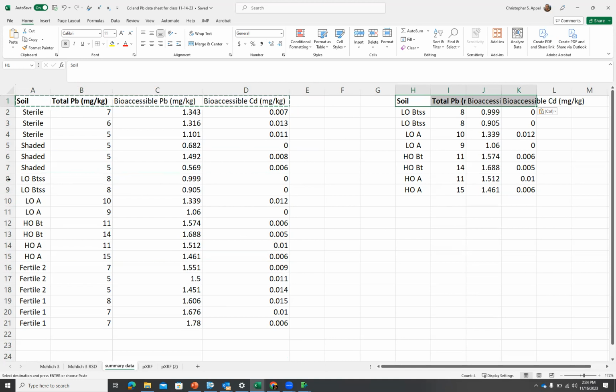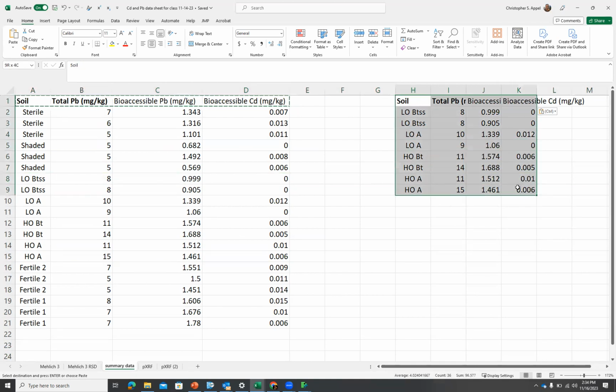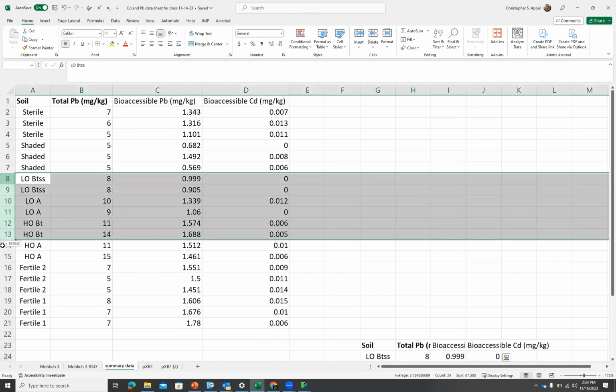Okay, now what I'm going to do is get rid of, right, that's a problem. So I'm sorry. Apologize for doing that incorrectly. So I'm going to just move it right now down here. Okay. And the reason why I'm going to move it down there is because I want to get rid of this now.